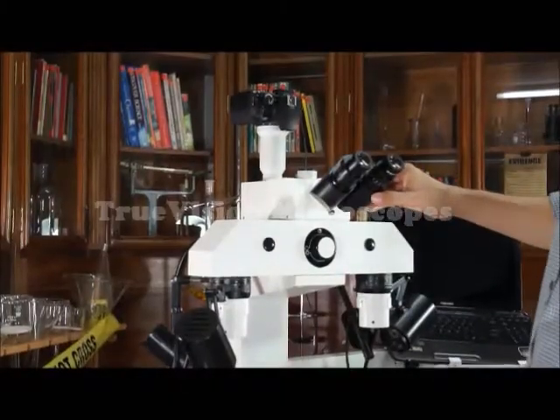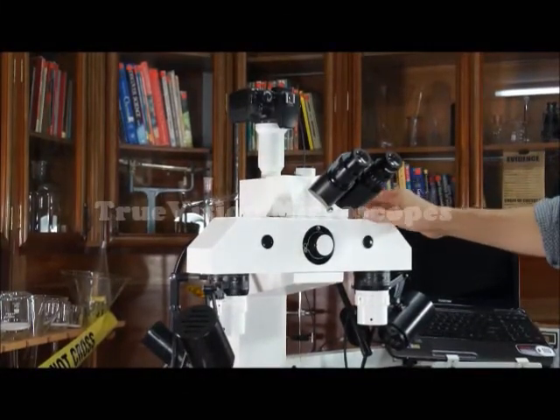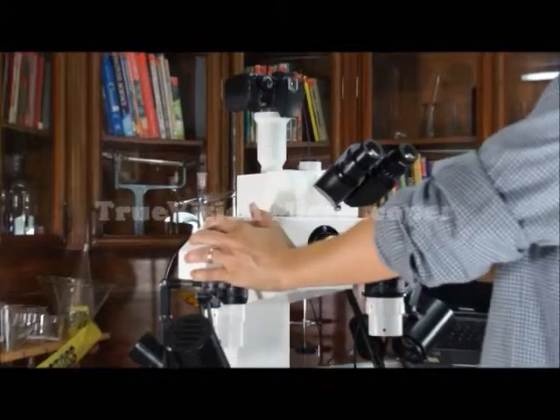This is a forensic comparison microscope. This is the comparison bridge.